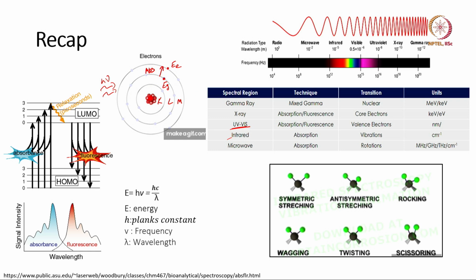If you want to know the basics of UV visible in detail, you can refer to our previous lecture. The initial phenomenon is called absorbance, but ultimately the energy is lost by the electron, which comes back to its original ground state, and this phenomenon is called fluorescence. To better understand this, we represent it in the form of molecular orbital theory, where we have the valence band and the conduction band, represented as EV and EC.